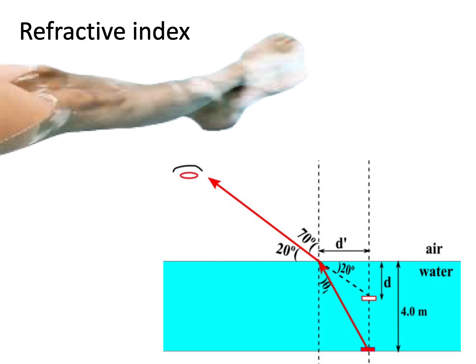And you've experienced this if you've had your legs dipped in the pool and they look like an illusion of bending in weird directions. It's because as light moves between materials within the water and crosses over the interface between the water and the air, these have material properties that are different, and the light's going to behave differently as it moves across that interface. And that's a reflection of the differences in the refractive index moving between those two materials. And it's also why not all objectives just use air.